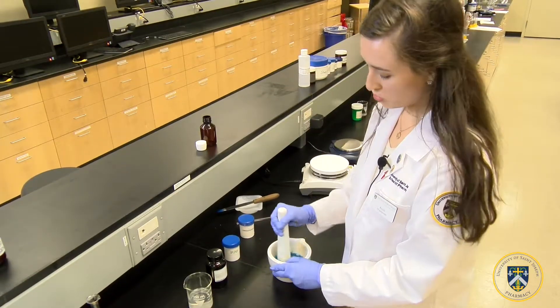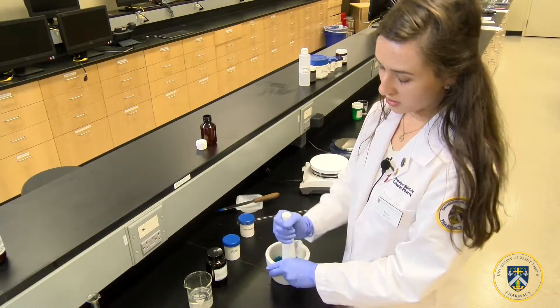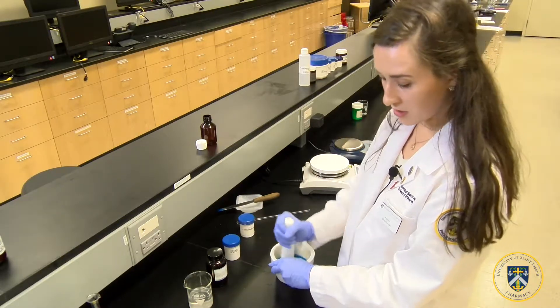Continue to mix the three ingredients including the food coloring in a circular motion to make sure all the powders are fine and consistent.